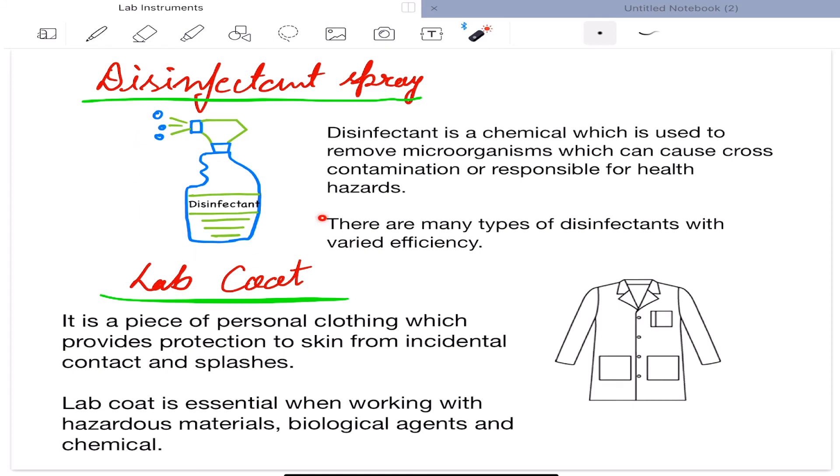Next is disinfectant spray. It is very important. Disinfectant is a chemical which is used to remove microorganisms which can cause cross-contamination or are responsible for health hazards. There are many types of disinfectants with varied efficiency. Now lab coat. It is a piece of personal clothing which provides protection to skin from incidental contact and splashes. Lab coat is essential when working with hazardous materials, biological agents, and chemicals.